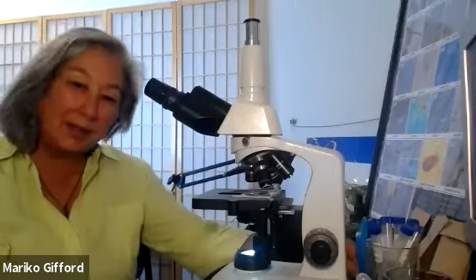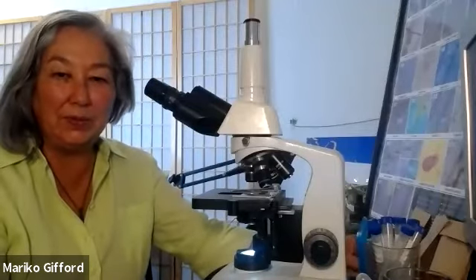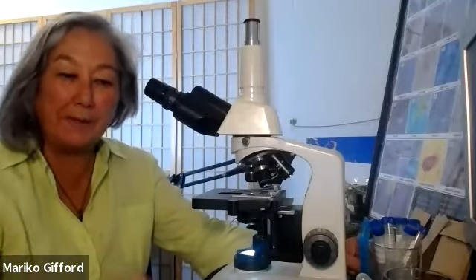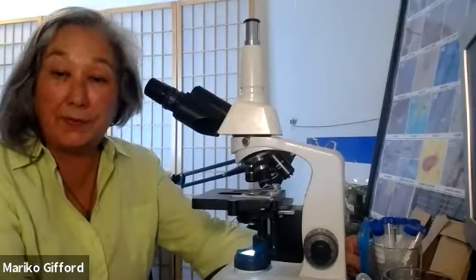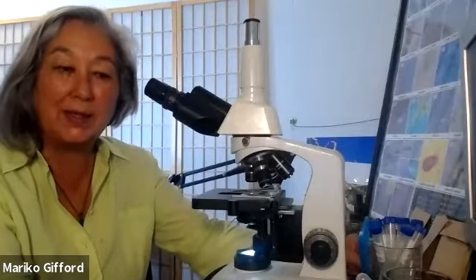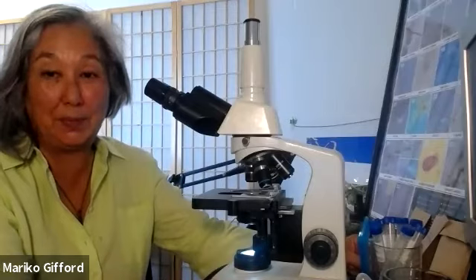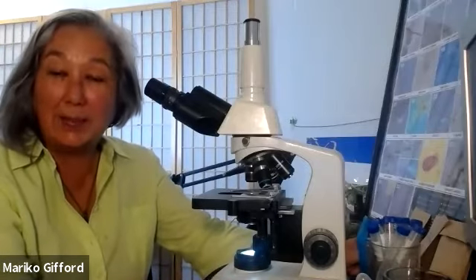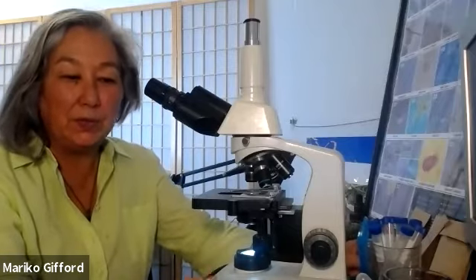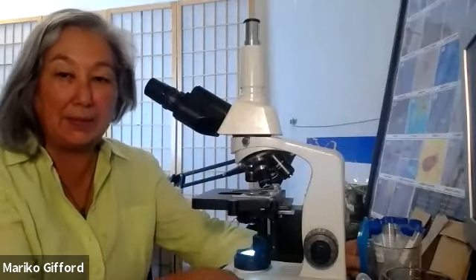Sometimes if it's very anaerobic, you have a lot of ciliates, that's a condition of having a lot of them. Now, you're not going to kill anything out. You're not going to just spray that with something. What you need to do is spread that out and put more aerobic foods in there, so that the aerobic population will increase and the anaerobic population will decrease, and you're changing the habitat so anaerobic bacteria cannot live there. So these are the measures that you want to take, and that's why it's important to be able to see what's happening in your soil.